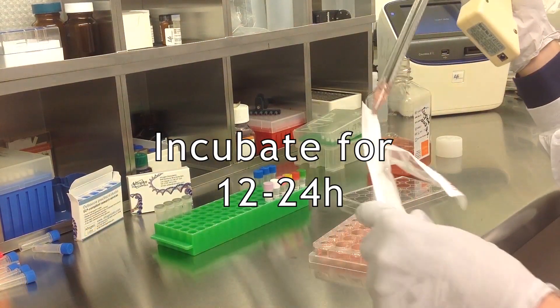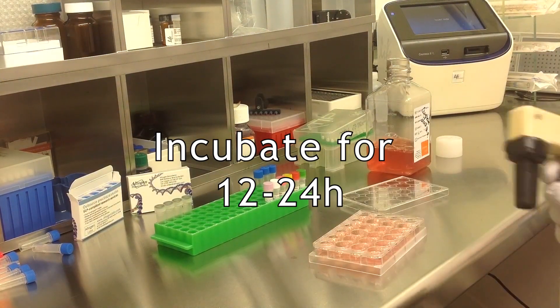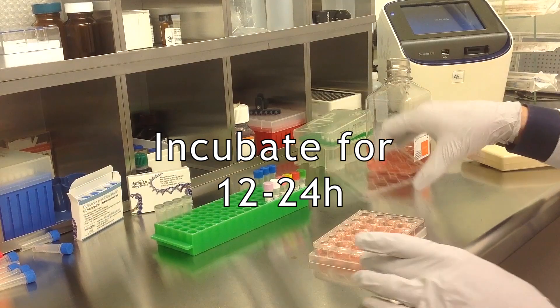Incubate the cells for 12 to 24 hours before transfection at 37 degrees Celsius in a humidified carbon dioxide incubator.